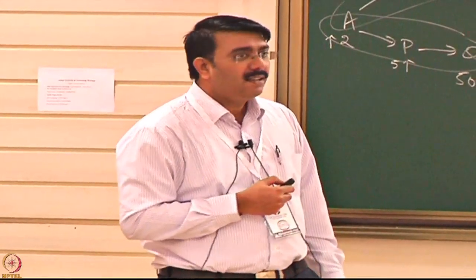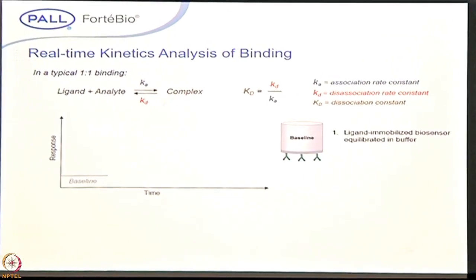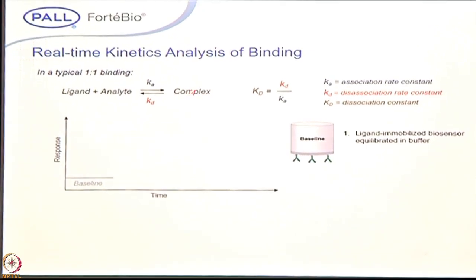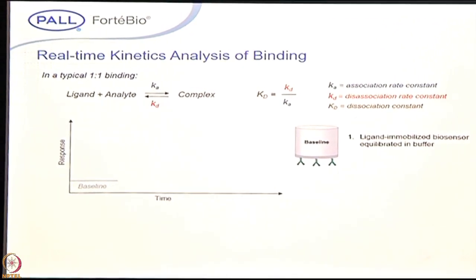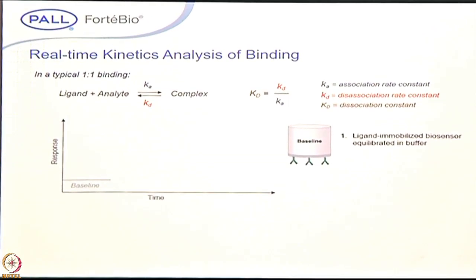When there is a ligand, suppose compound A and protein B, this forms a complex, and this is the forward direction. When the complex forms, finally it dissociates once again into A plus B. So these label-free interaction platforms are applicable to reversible kinds of reactions.